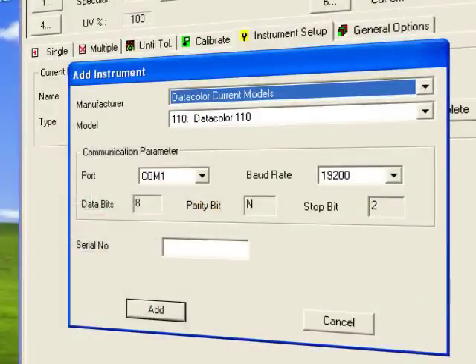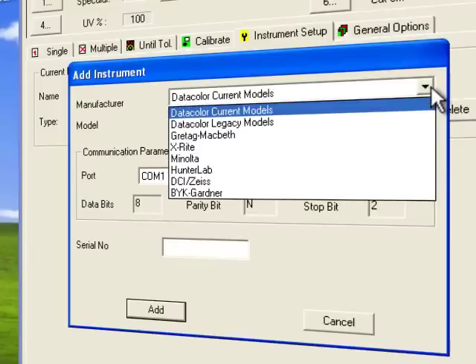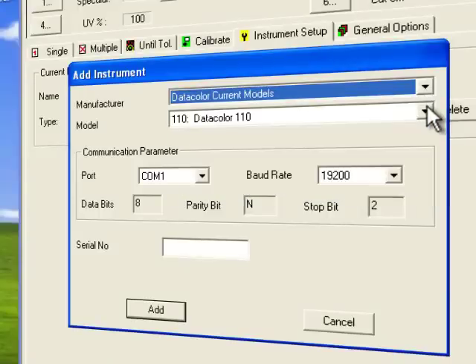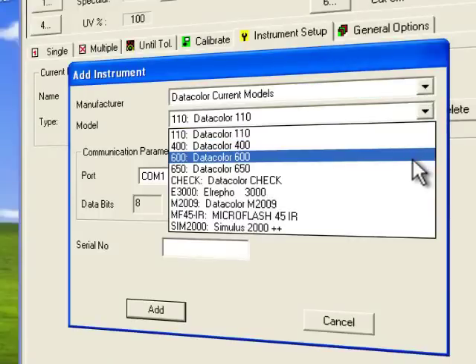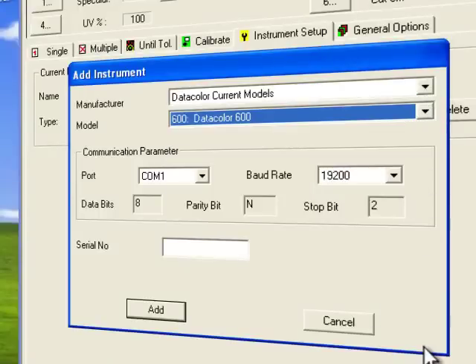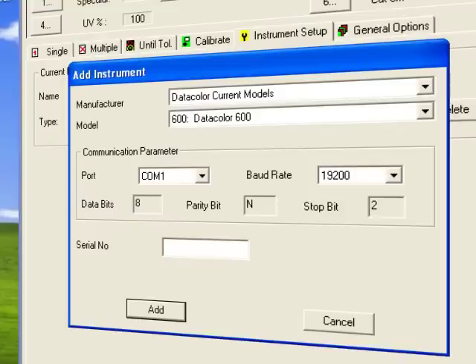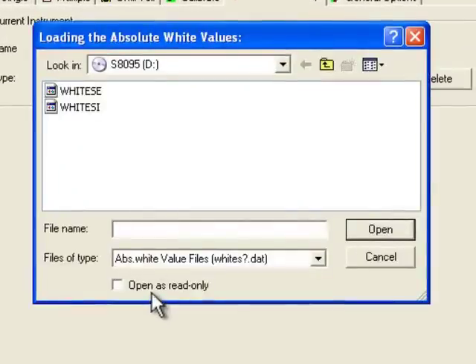Within the Add Instrument window, the user will first choose the manufacturer of the instrument from the pull-down list, then the instrument model. The communication parameters are available by default and the user has the ability to adjust them if necessary. The user will then input the serial number. Once all the information is added, press the Add button.